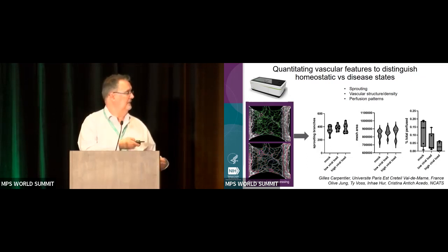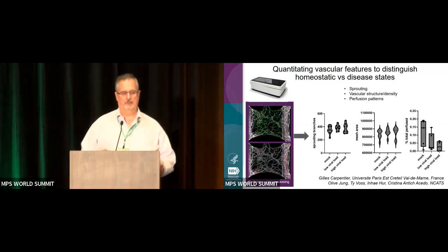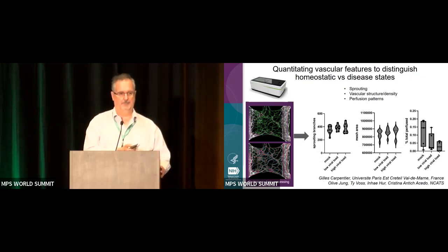And as you can see, when you infect, in this case with influenza, some of the parameters don't change, some do change. And that's the beauty of these systems. You can look at different parameters and see which one changed depending on the disease model that you're creating.